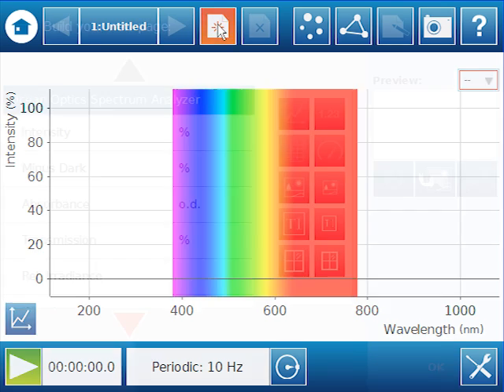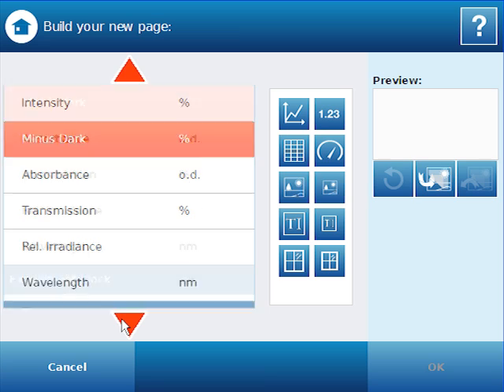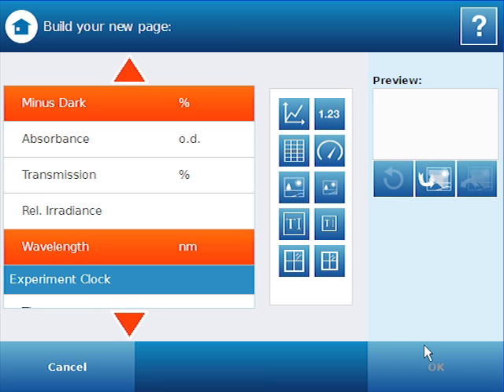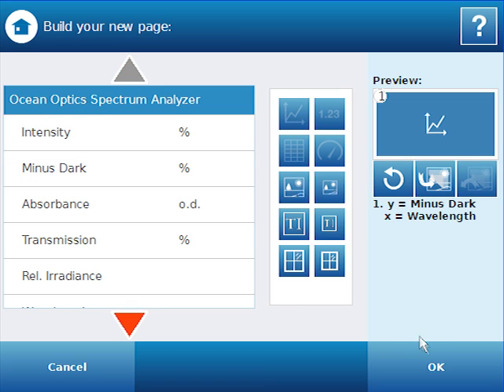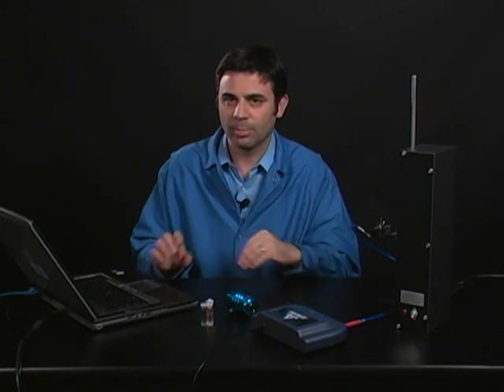I'm going to build another graph of minus dark versus wavelength. And we'll make another graph. And it looks pretty identical to the first graph, but there is one slight difference. The minus dark compensates for room light.